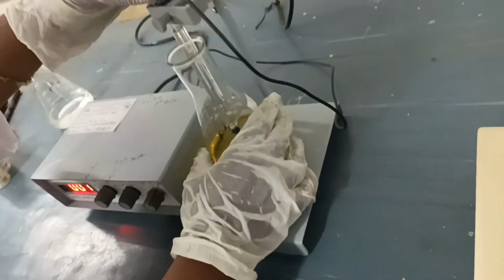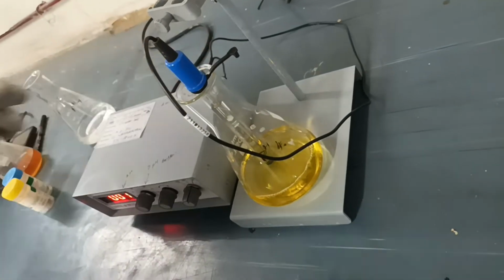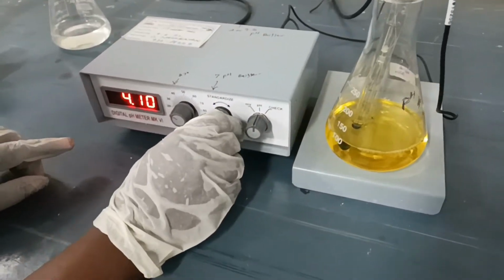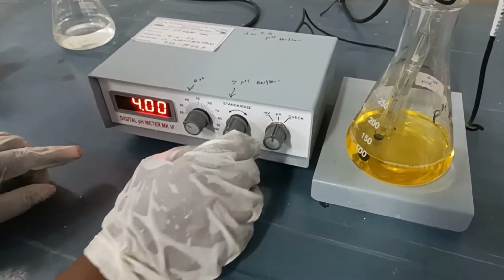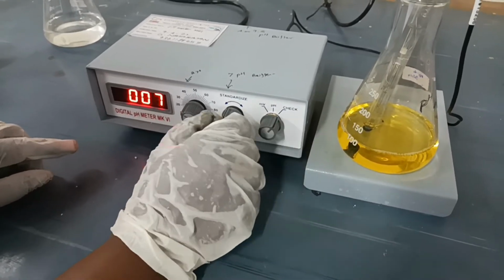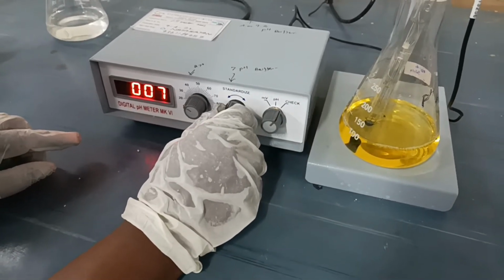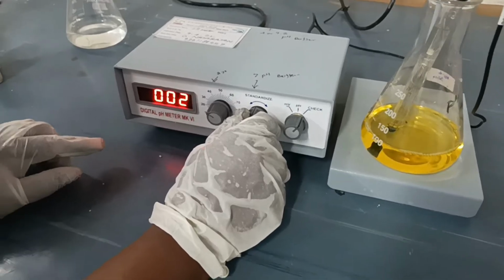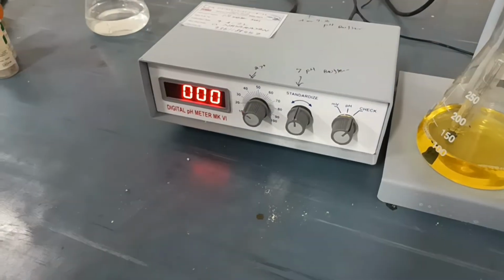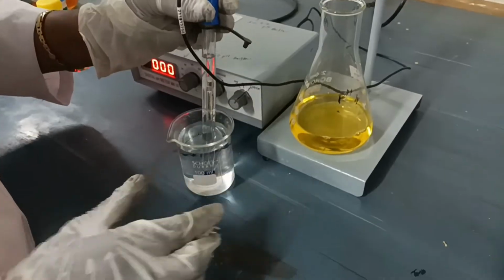Now go for calibration. Dip the electrode in the pH 4 buffer solution. Rotate the function knob to check the pH mode. Adjust the pH using the calibration knob and finally go for checking mode. The checking mode display shows 0. After finishing the process, check the pH without using the calibration knob.